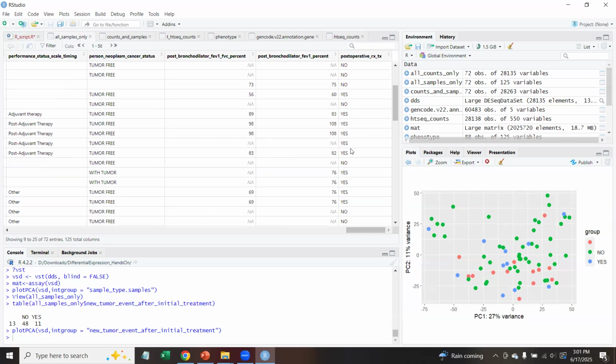And if it's going to be that latter, think about maybe you want to limit it to only tumors first. Like, are you going to compare deceased versus alive? Limit it to only tumors and then compare deceased versus alive, because it's not going to make sense to have those normal samples clouding up your comparison. So that is my warning.